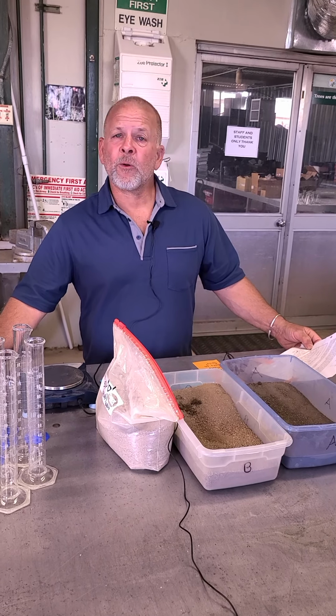So I'm going to go ahead and provide you with the electrical conductivity of these, and I might even give you the SAR, and you can look up those terms if you've forgotten what they mean. You'll have a table that shows these treatments in your lab exercise handout, and I'm also going to put the data table there for the results of what we're going to do today. So let me just summarize again. 4 different treatments: no salts, then dominantly calcium with a little bit of sodium, then dominantly sodium with a little bit of calcium, and then a lot of both.